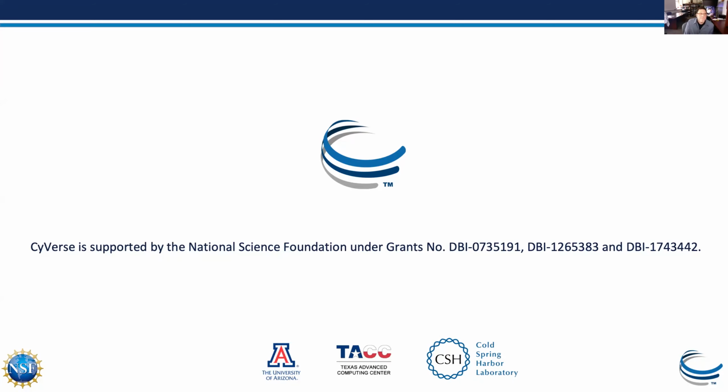Okay. Another question is, the Circos ideogram is quite cute for the human genome, but will need to be generated for other fungal and or plant genomes, right? Do you have any suggestions on how to best do that?